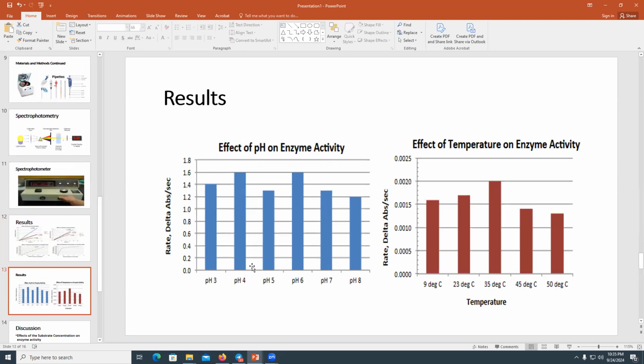And that shows us that enzymes have an optimal pH that they will operate at, an optimal temperature, and also an optimal salinity. So it's not like, oh, the higher the temperature, the better. Obviously, when you increase the temperature, the reaction rate goes faster, because temperature is the average kinetic energy. But the problem is you're going to reach a point where you heat things up so high that you're going to denature this globular enzyme, and the pH also.